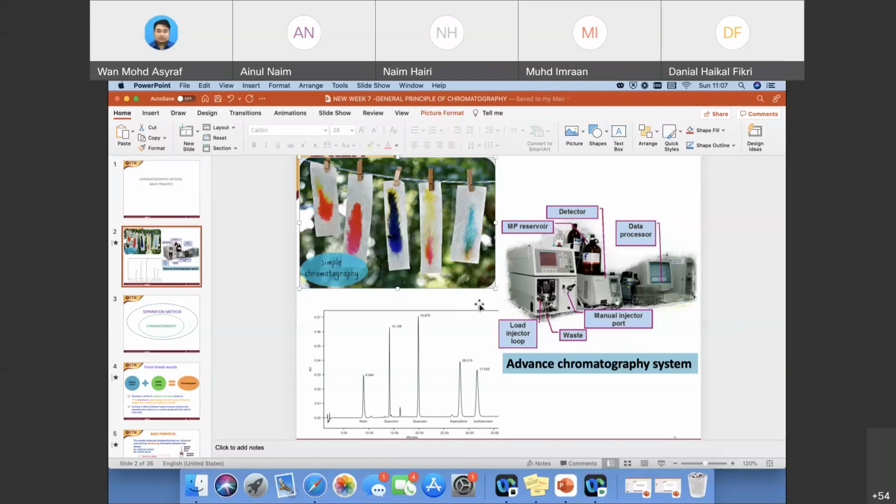So now I want you to understand that chromatography, based on this simple example, is a separation of substances inside your sample. So in this case, you say that my sample is a pink color ink, but little do you know, inside the pink color there is also a yellow pigment inside it. All right. Based on that, Muhammad Ainul, do you understand? Understand, Doktor. Okay, good.